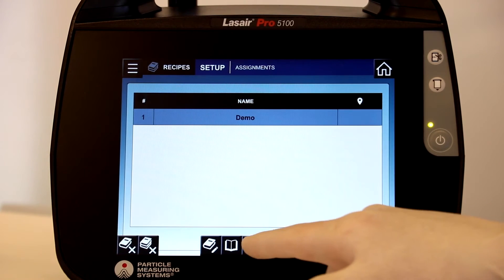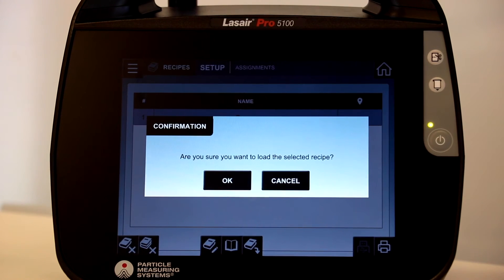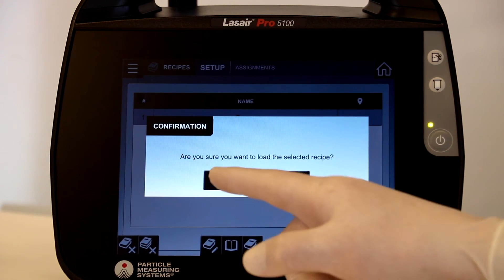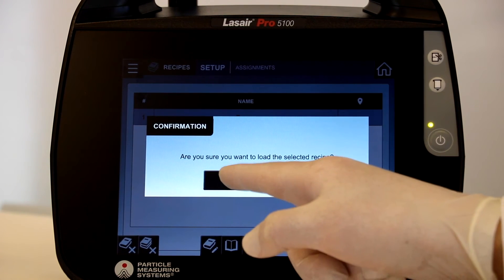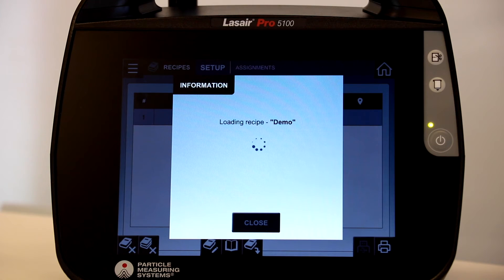Now, we will load the recipe, which will prompt a confirmation screen. Select OK. The recipe will then load to the unit.